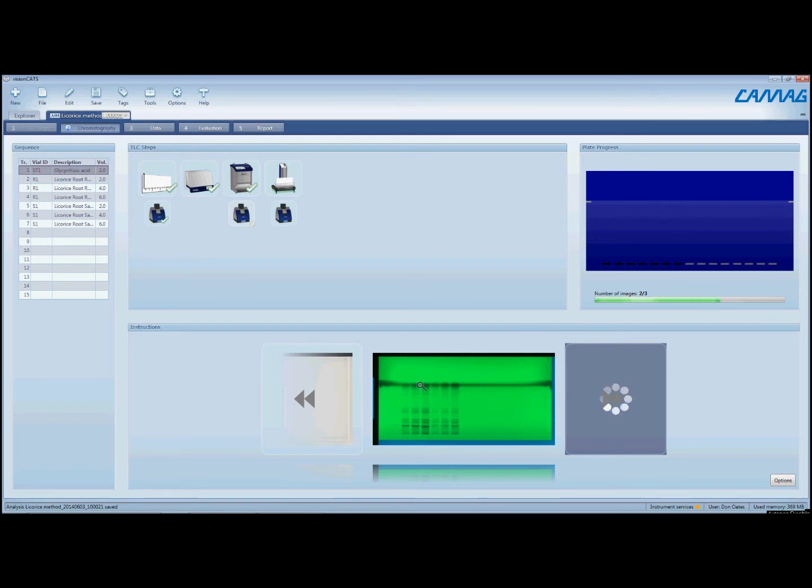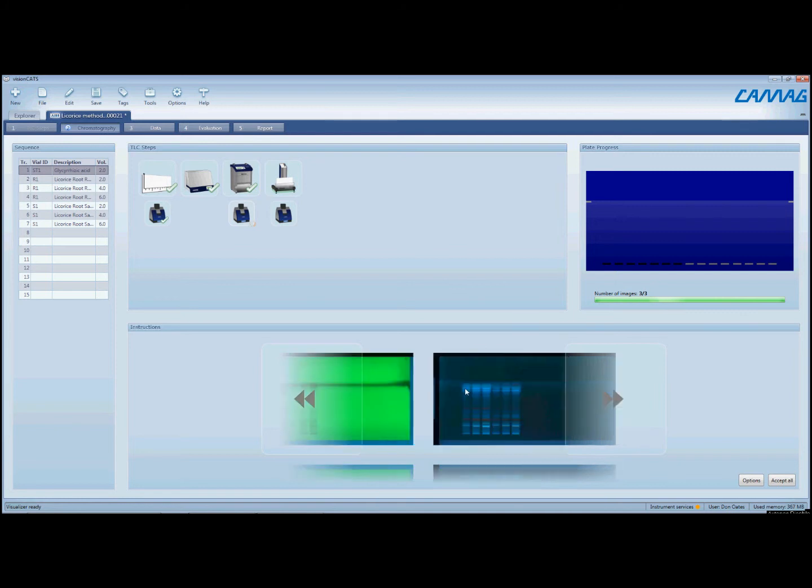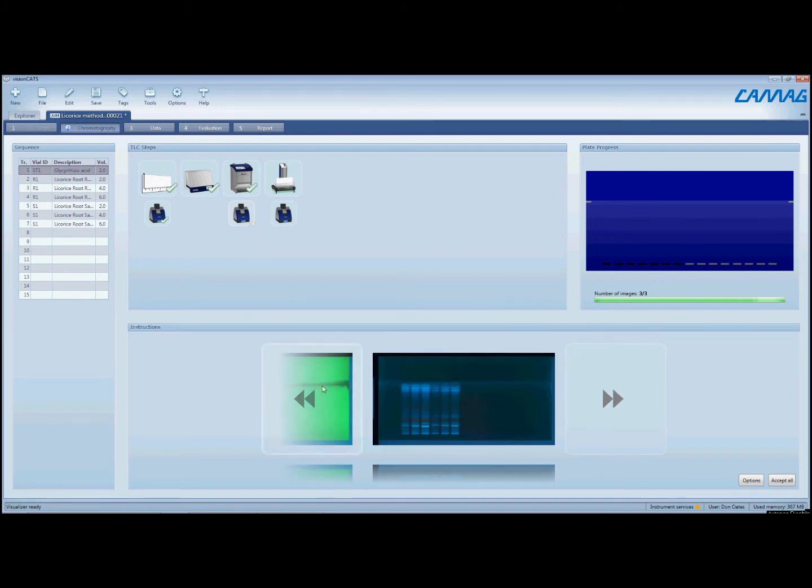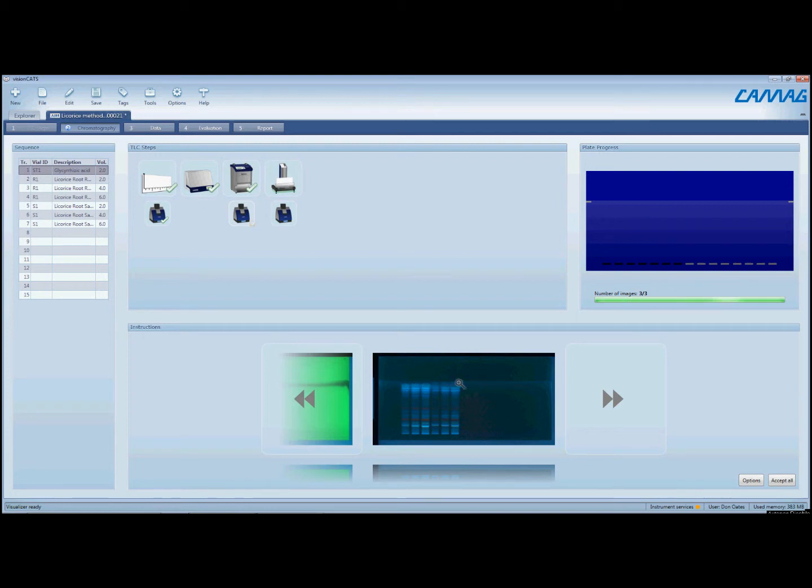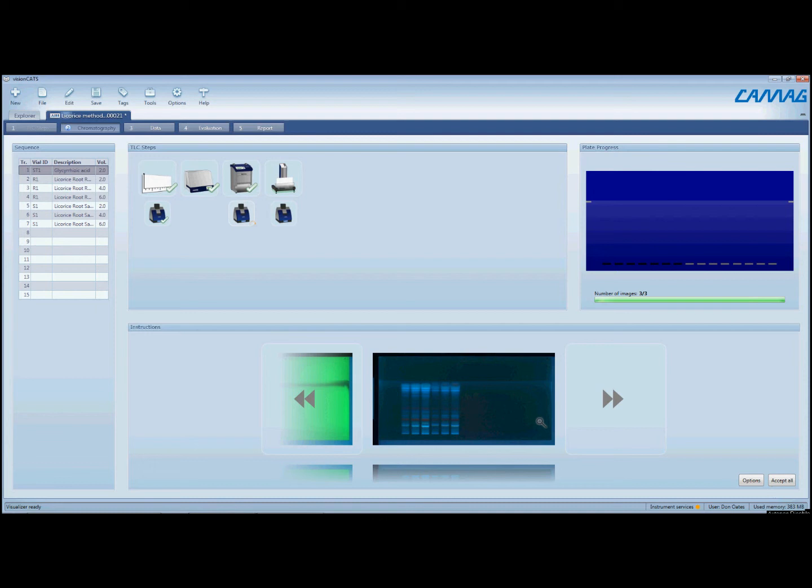And that will reduce the likelihood of getting this sort of dark band at the top. For this particular application, it's okay. We're not really concerned about the fractions up here at the top near the solvent front. We're more concerned with what's down here. But yeah, you can get rid of that by doing a pre-wash of the plate.